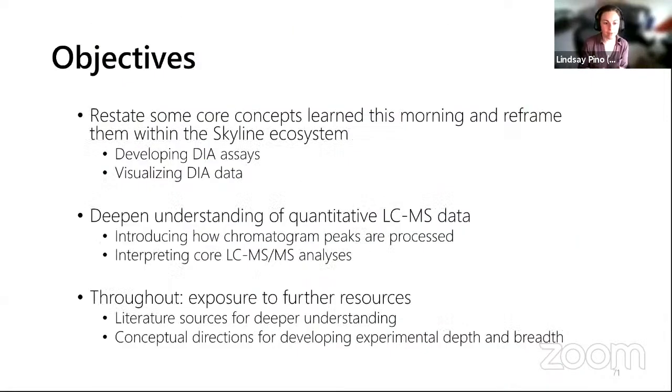And the three main takeaways, hopefully, that you got from this: taking some of those core concepts that Brian had mentioned earlier and putting them in context in the Skyline software, and what they mean in Skyline; thinking more about the quantitative LC-MS data, and especially why it can be challenging with DIA when interpreting chromatograms and processing that kind of data; and then lots and lots of literature in there. Hopefully this gave you a lot of jumping-off points for your own work.